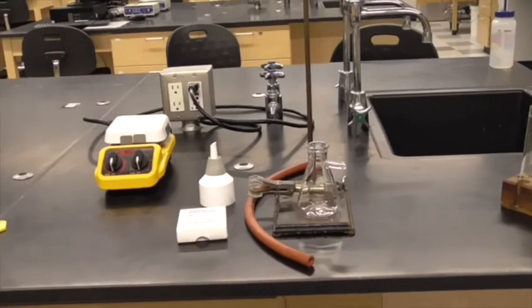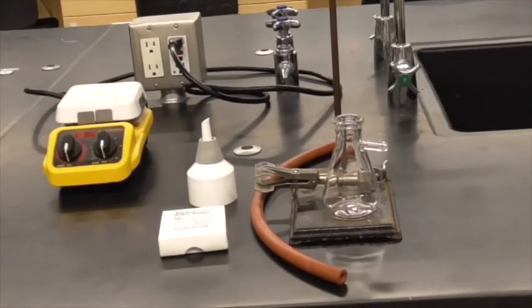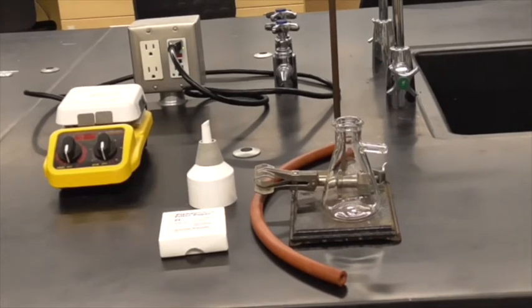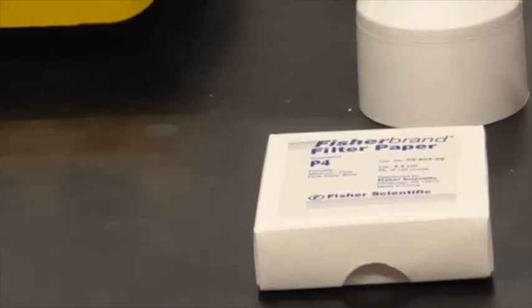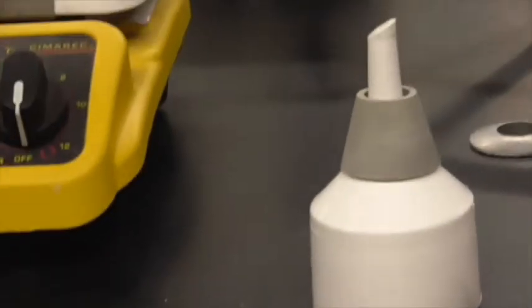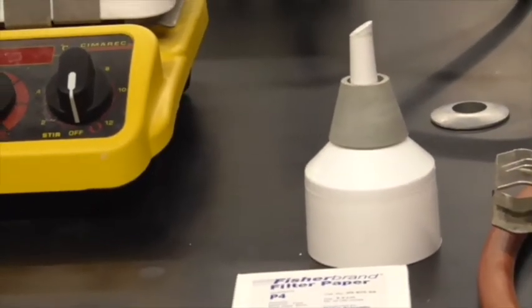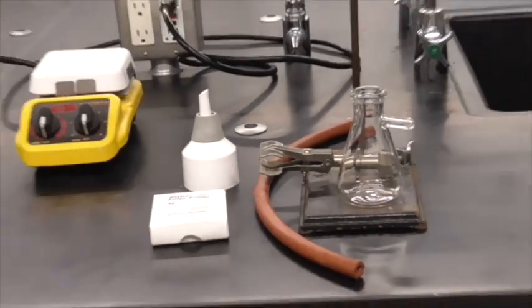We have a ring stand. You can see we've got a sidearm flask there that we'll connect the vacuum to. The box contains filter paper, so we'll weigh a filter paper just like we did with calcium phosphate. The funnel there is to put the filter paper in. So we'll show how to set that all up when we get to that point.